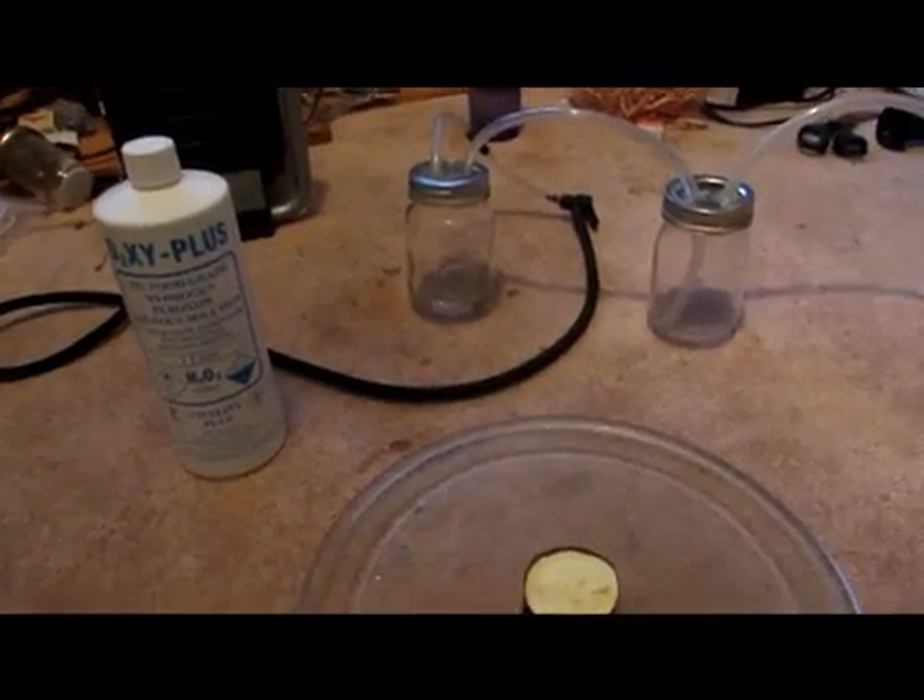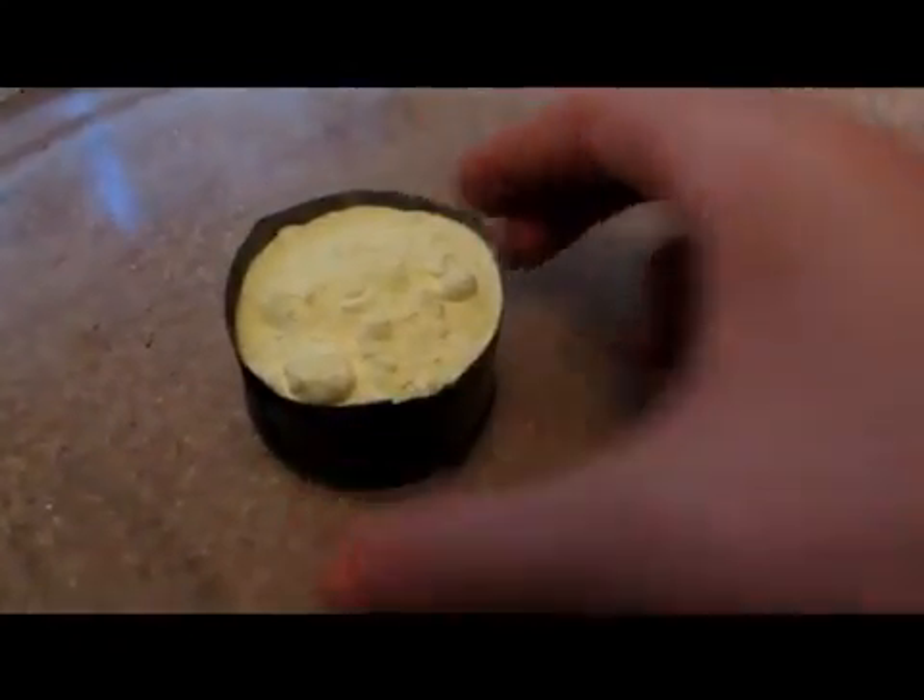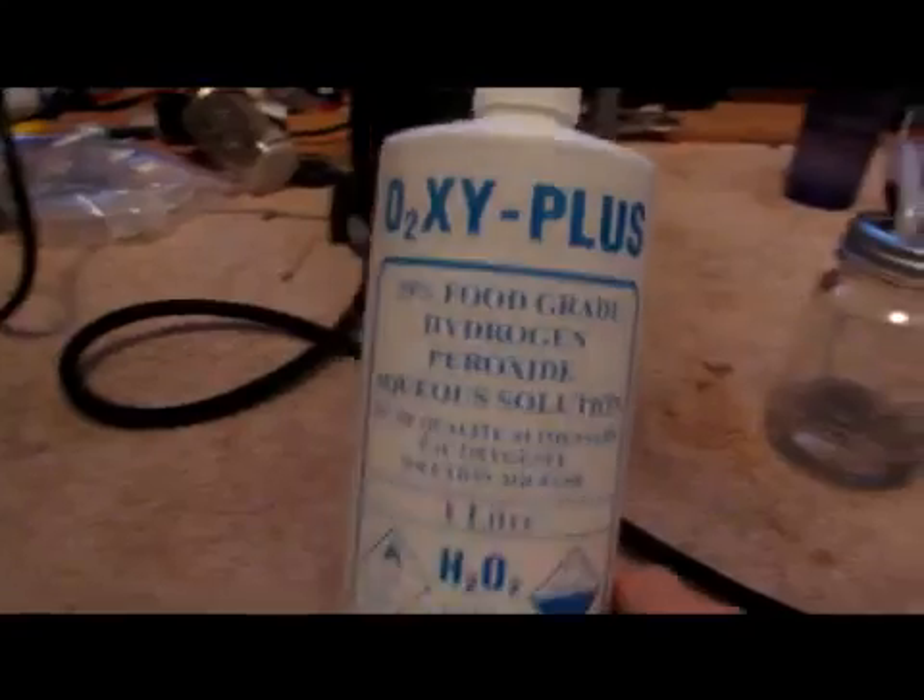Hey guys, today we will be making sulfuric acid from hydrogen peroxide and sulfur. We got this sulfur in a previous video, so if you want to go check that out, you can see that. And then this hydrogen peroxide, you can buy at most pharmacies and stuff.